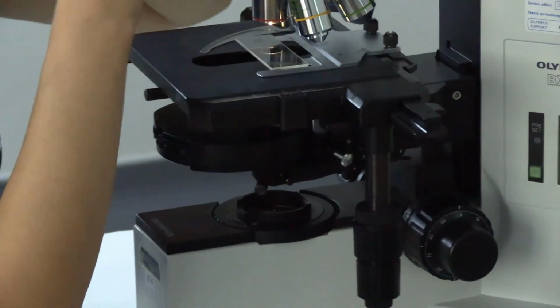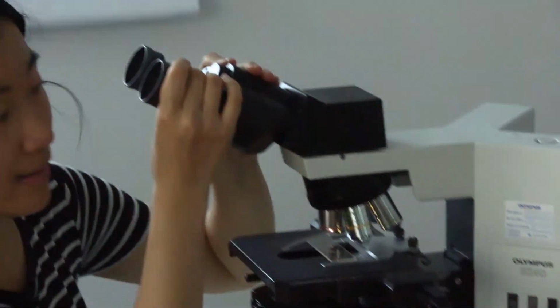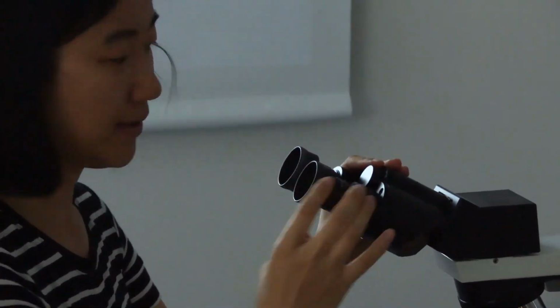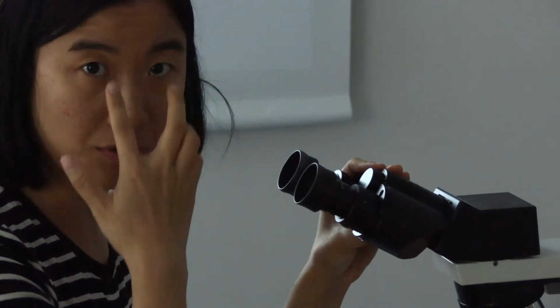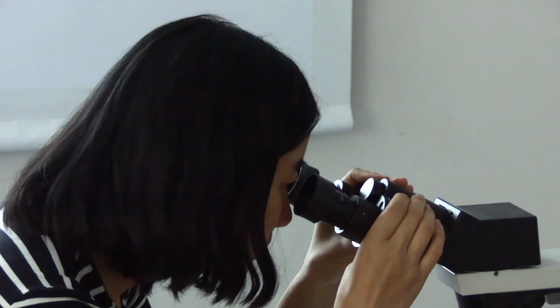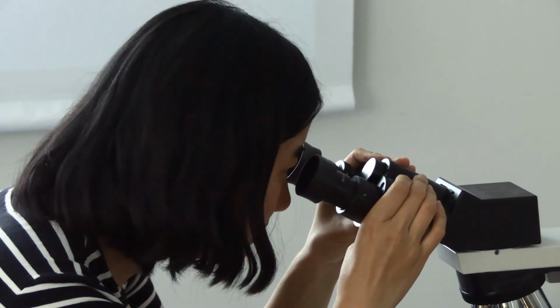And also the important thing, which I didn't mention previously, is when you look through the eyepieces, you really need to adjust the two eyepieces according to the distance of your two pupils. So try to turn a little bit the distance.